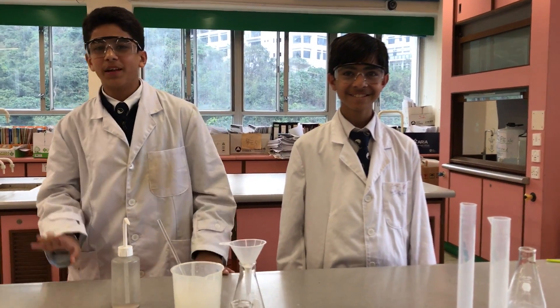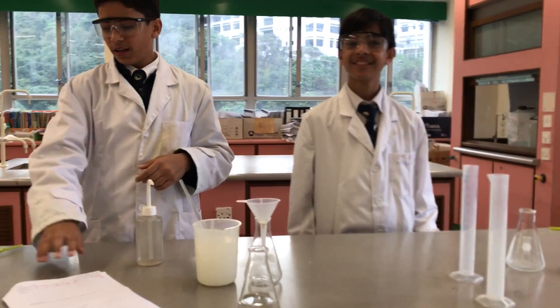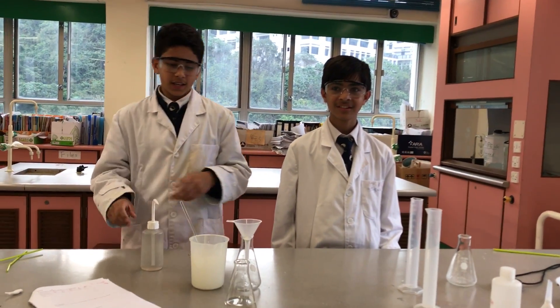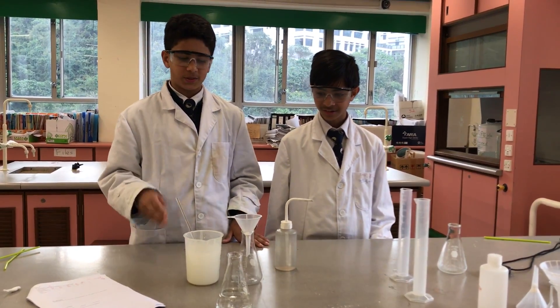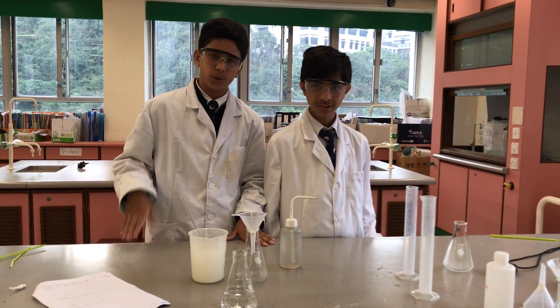He was about to cry this morning because we failed to do this experiment of making limewater turn milky and then to colourless. So today we're going to be doing the experiment for you guys to see. And on Thursday it will be a real experiment and all of you guys will be doing it with us.